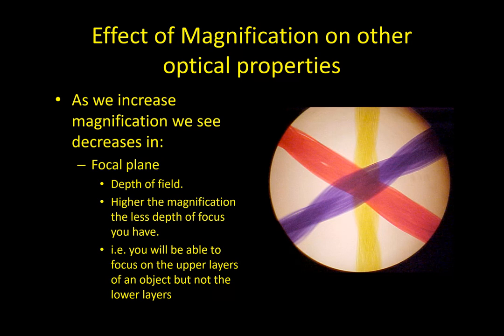Depth of field, this is the hamburger, okay? In the lab, we actually have a slide that has 3 strands of silk thread. And depending on how they actually put those strands on the slide, you'll notice one come into focus, then another will come into focus, then another will come into focus. Kind of like that hamburger bun going from the bun to the lettuce to the tomato to the meat to the bottom bun. You're literally going through those planes, those layers as you magnify.